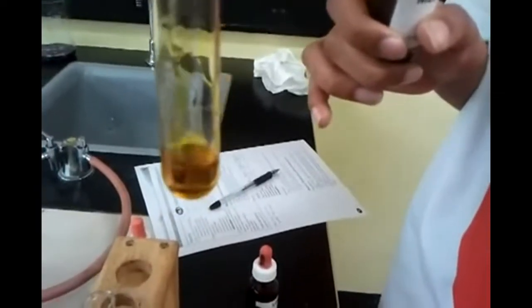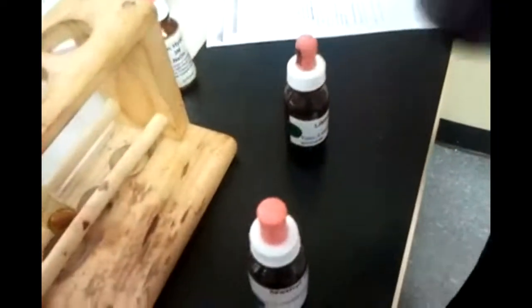This is methyl red and it's brown. Water turned brown, sodium chloride also brown. And hydrochloric acid turned red — the color of love, anger, whatever you want to call it. Sodium hydroxide turned brown as well. The acid is the only thing that turned red.